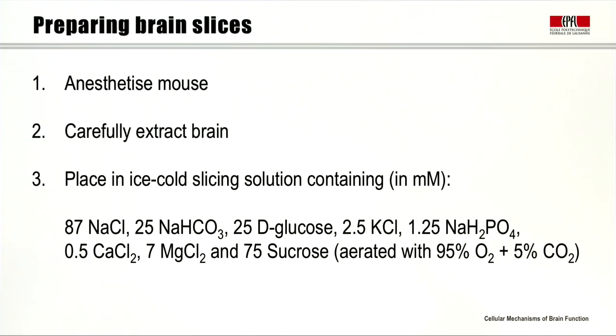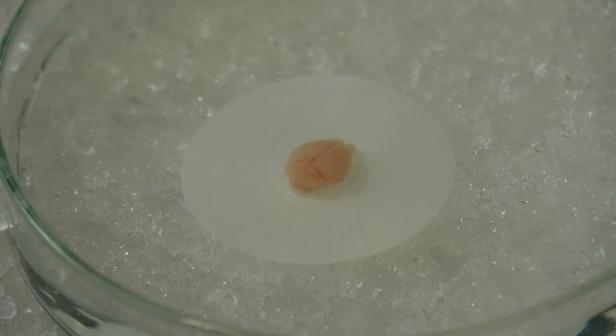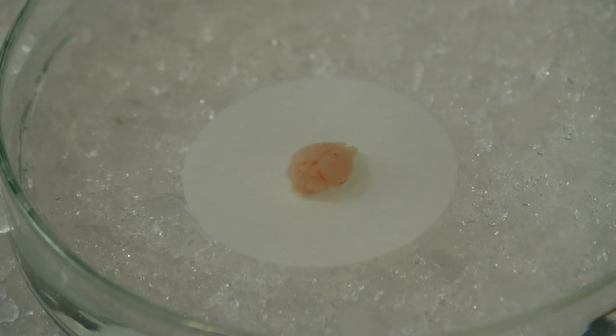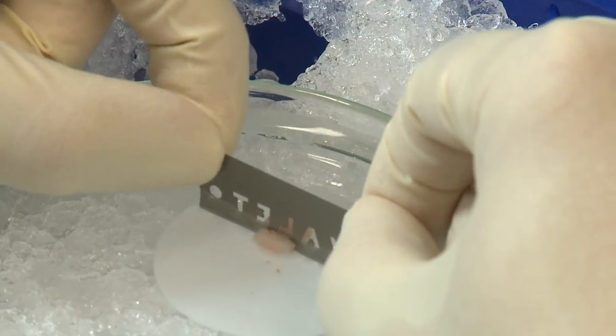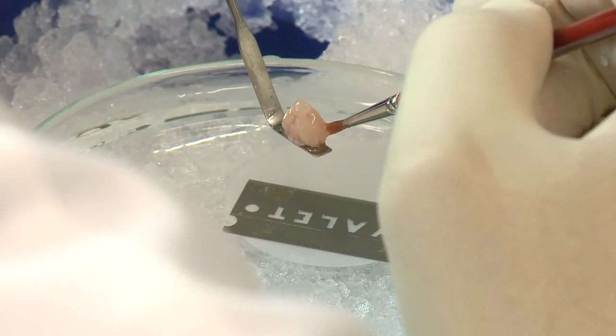This solution is not a normal artificial cerebrospinal fluid. It is modified to keep the cells healthy during the cutting process. We extract the brain from the mouse and place it in the ice-cold sucrose-based slicing solution, which helps to keep neurons in good condition during slicing. Then we chop off the cerebellum, since we will be recording in neocortex and do not need that brain region.